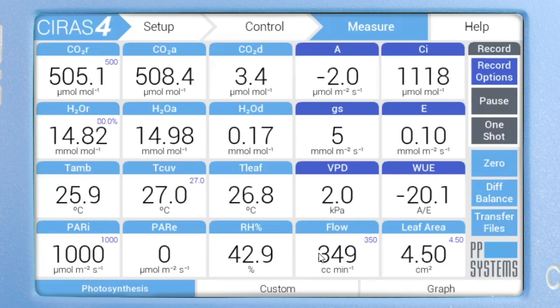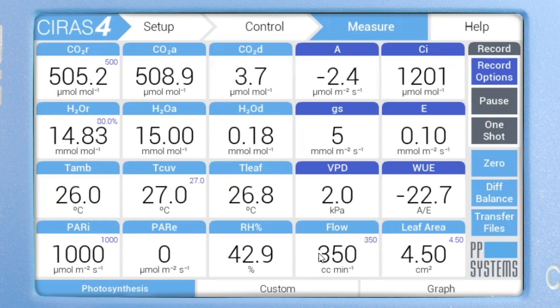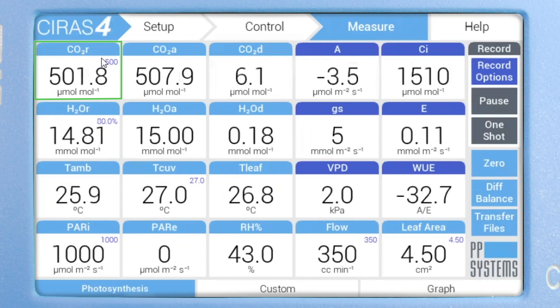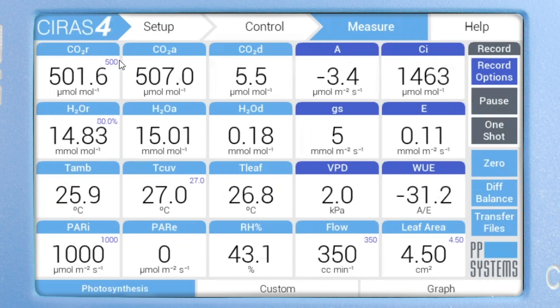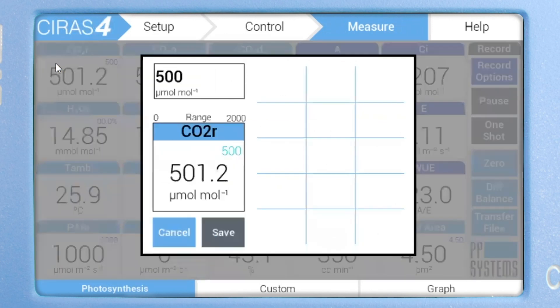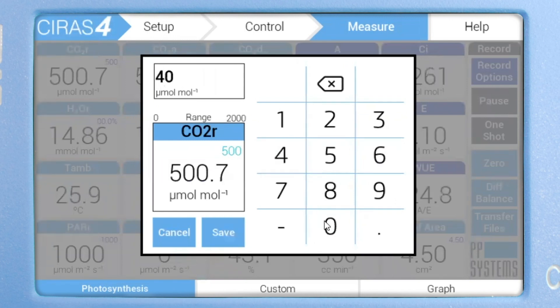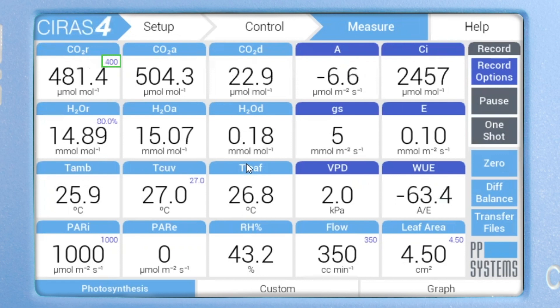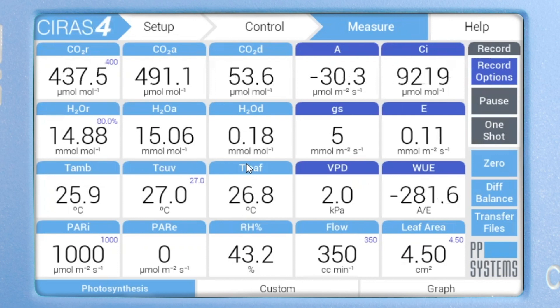You can also set the environmental controls faster and easier directly from the main photosynthesis screen simply by tapping on the individual tiles, saving valuable time in the field. For example, let's have a look at the CO2R tile showing our current reference CO2 concentration. The current control setpoint of 500 is displayed in the upper right corner of the tile, which I can change simply by tapping on the tile. Now notice the new control value in the upper right corner of the CO2R tile — the CO2 concentration will stop dropping once it reaches its new setpoint.